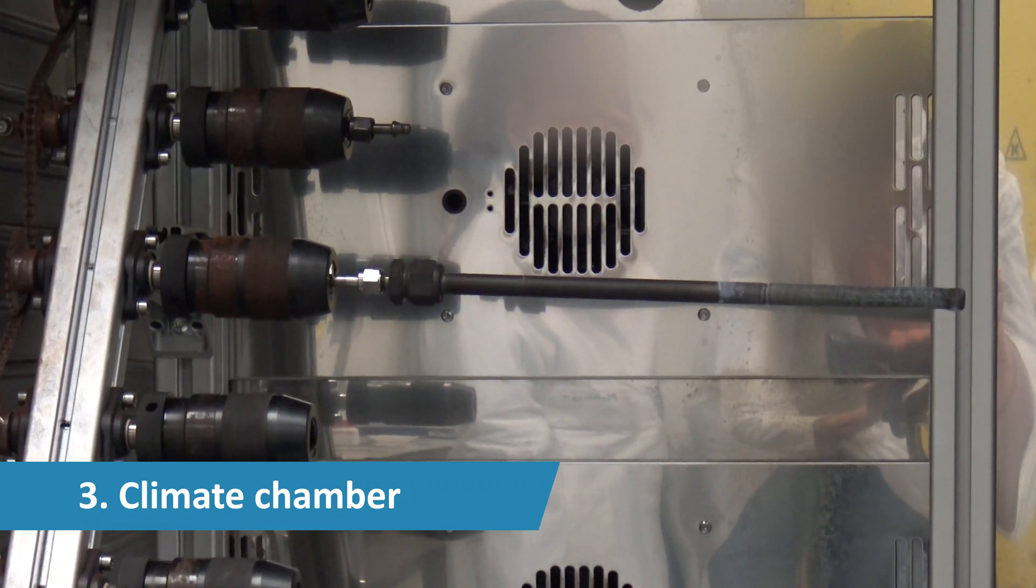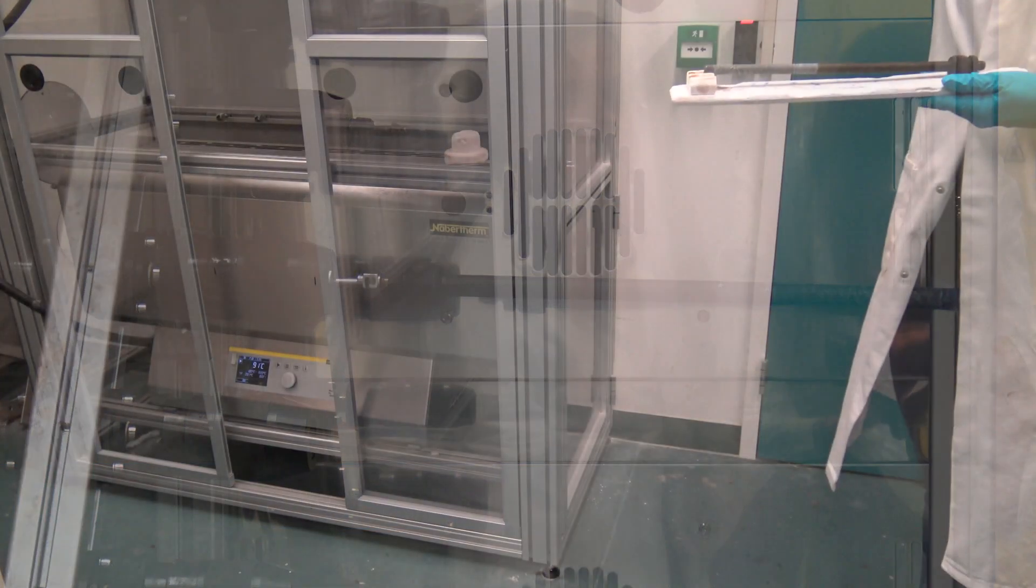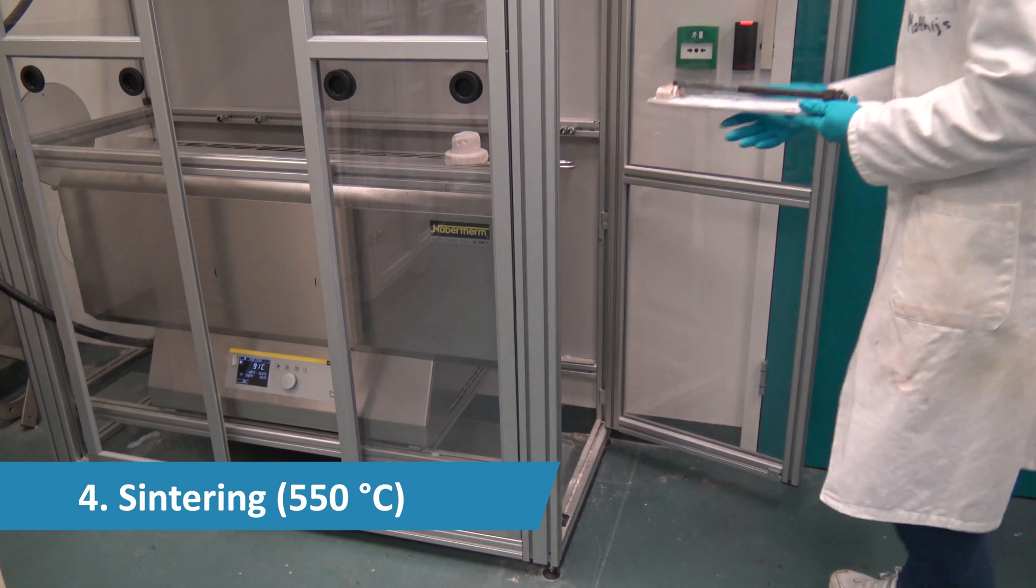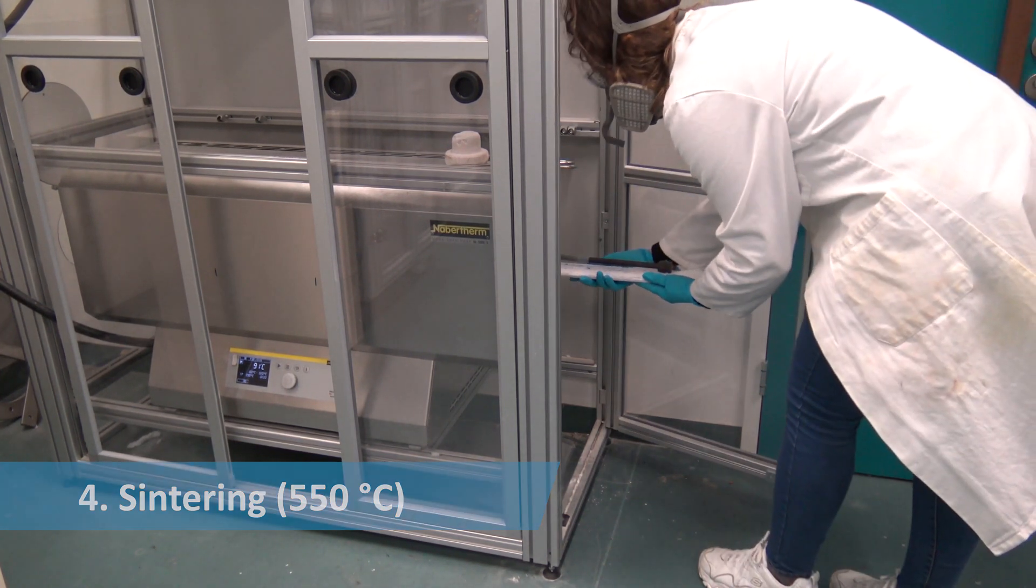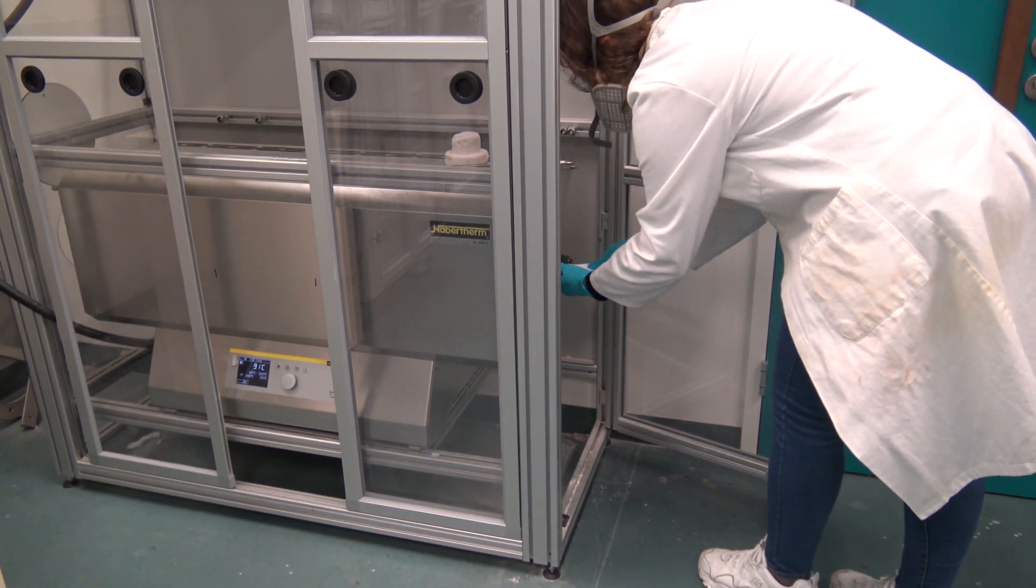The deposited layer is dried in a climate chamber at 40 degrees Celsius. To finalize the diffusion protection layer, the support is sintered at 550 degrees Celsius in a static air furnace.